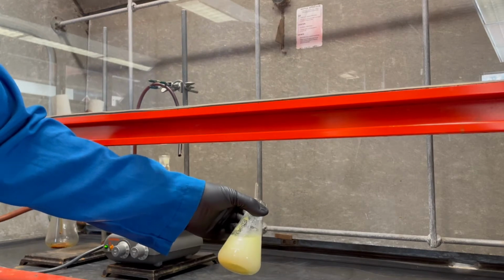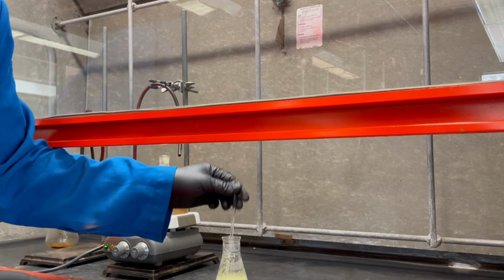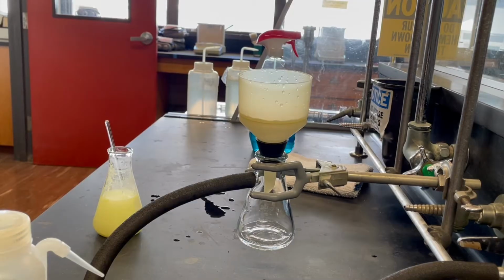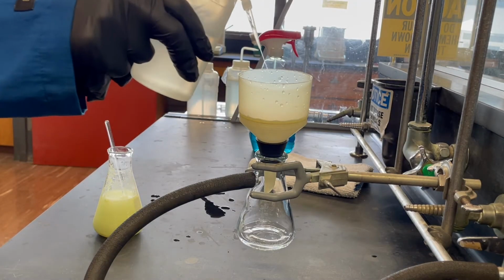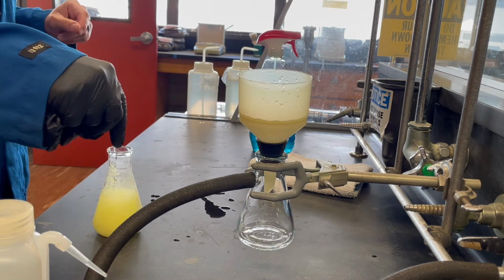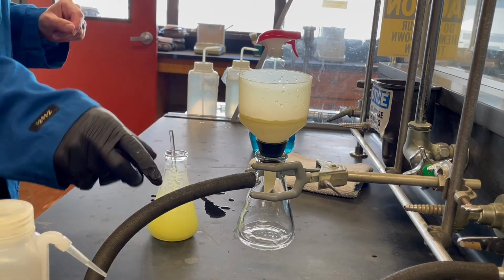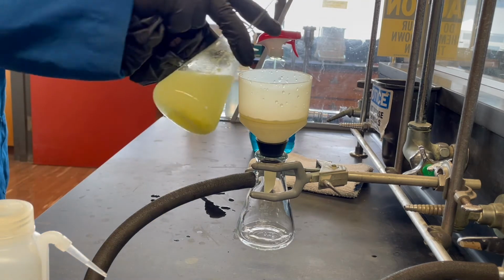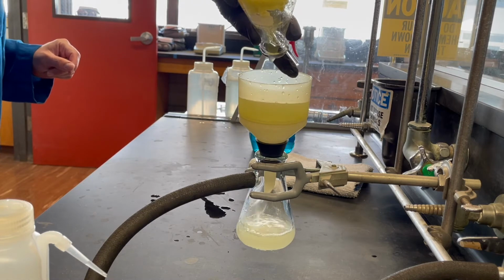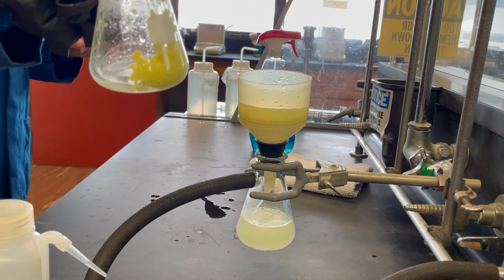Okay, so here we go. Let's go ahead and get that filtration process going. Okay, so I already hit this with a little bit of water, get everything all wet. So I'm going to go ahead and stir this up really well, and then pour that bad boy right on there. Woo, solid material, we're gonna get you out. We got a lot of solid stuck in the flask.